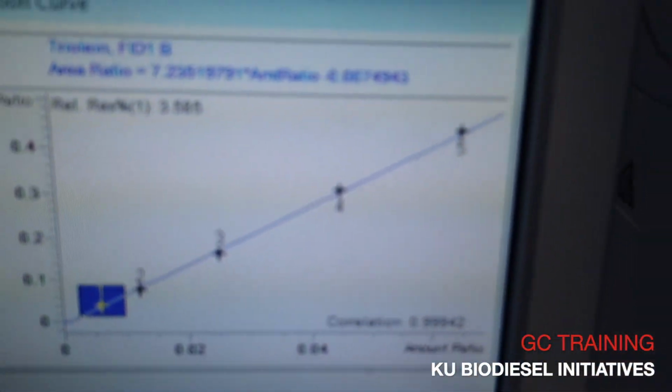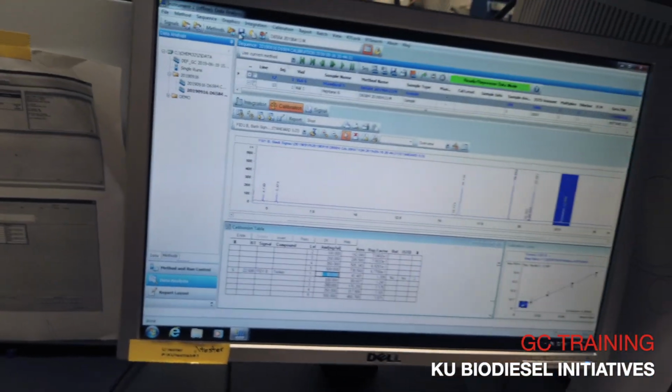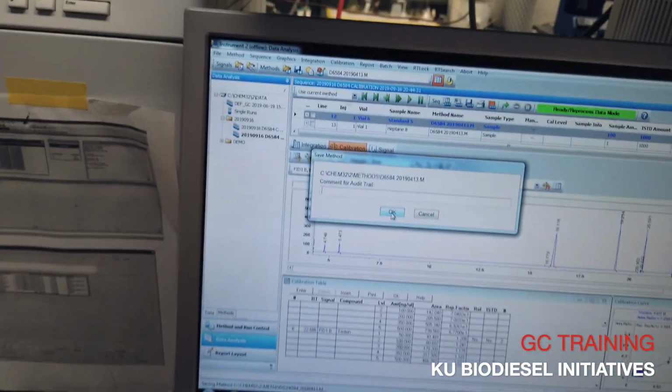That's pretty. All right. 3 9s. Wow. That one could be a little better, but okay, it's a good start. Hey, love the hustle. Love the heart. Good start.